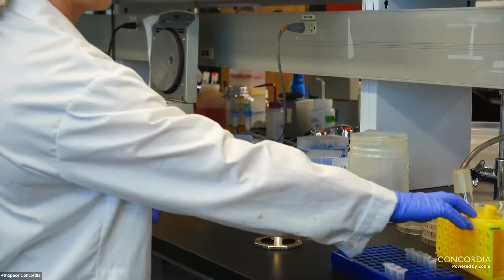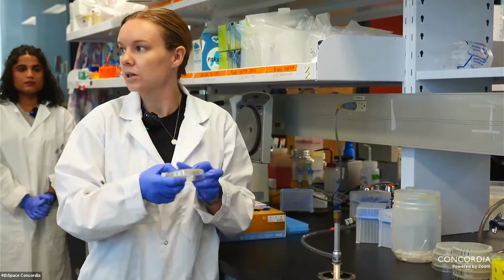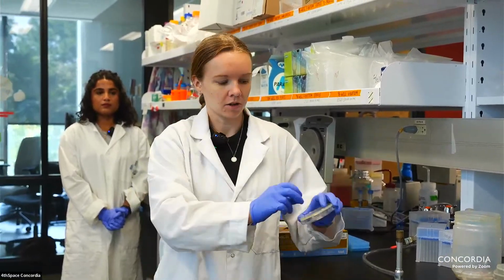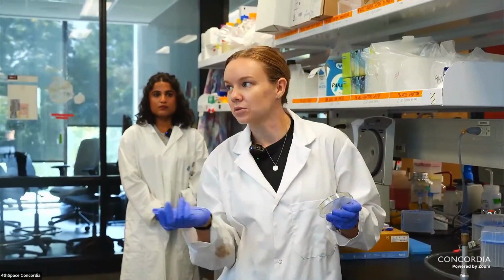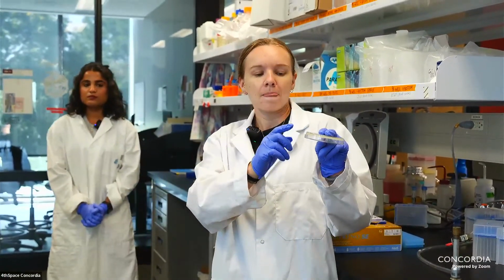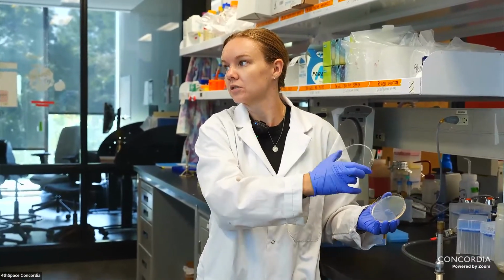Like we mentioned, the 3 black lines are going to be your yeast plates, and the 3 green lines are going to be your bacterial plates. You can pick one or the other. Take a marker and write your name, or just your initials if you want, on the top, so we know whose is whose. You can see there's agar in the plate. Right now it's flipped upside down, but when you flip it over and take the lid off, this is where you're going to be streaking, on the inside there.